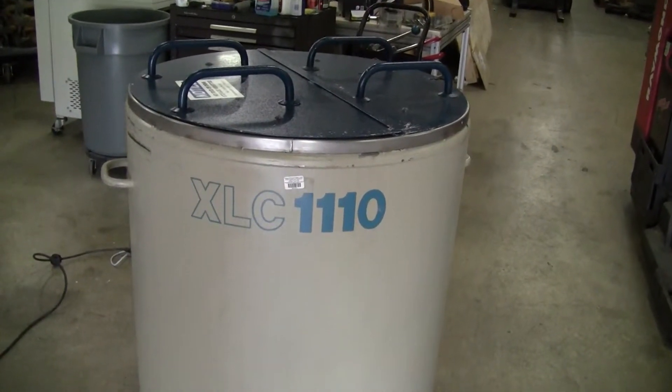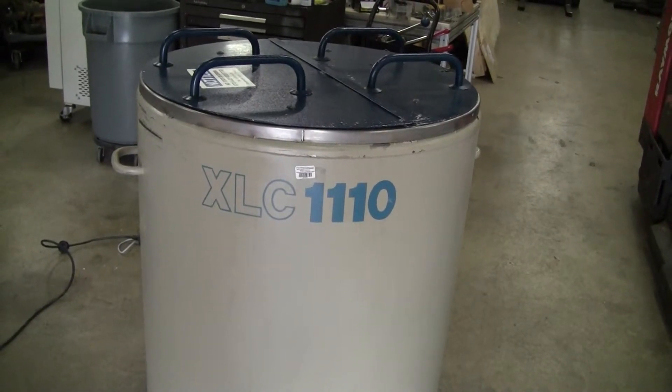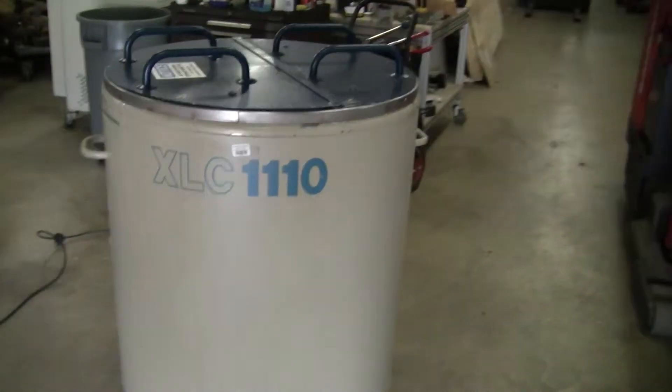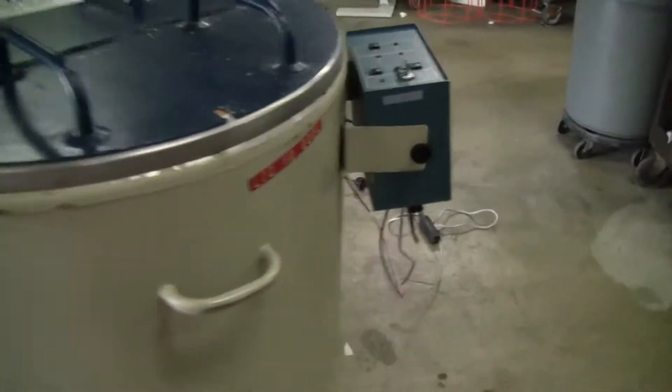Hi, this is Jim from HitechTrader. We're looking at the MVC Cryogenics XLC 1110 liquid nitrogen tank Dewar. It is 22.8 liters.